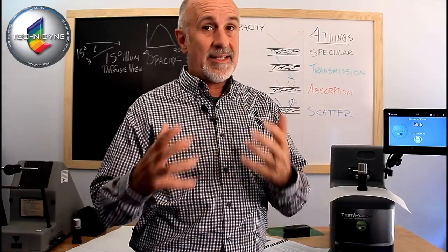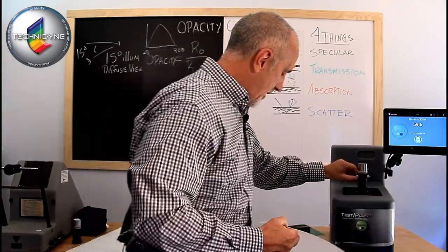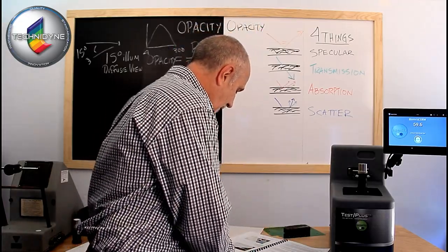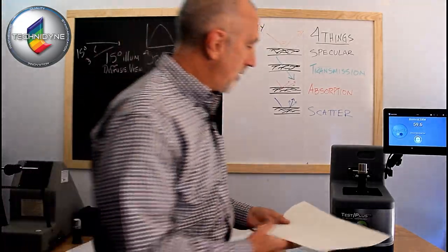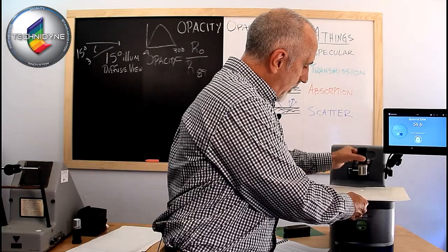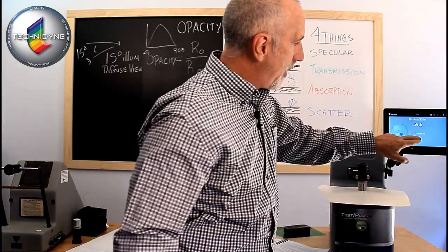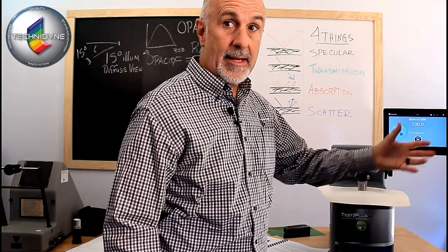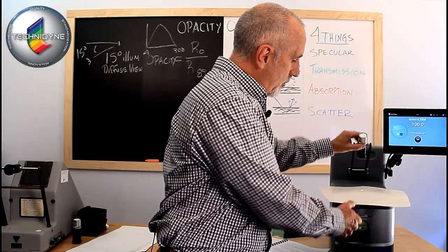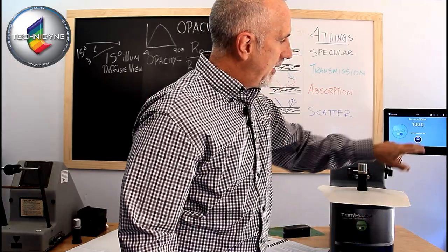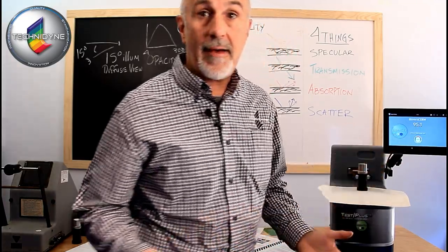Now let's look at something that I think will have a high opacity to this sheet. So I will load it on there, back it by the white backing, sets it at 100%, rotate to the black backing, hit test, 95, 95.1.